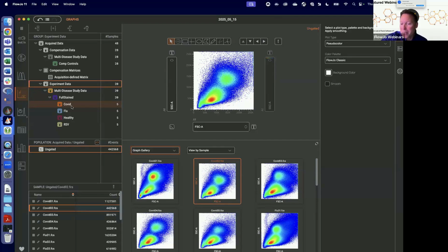Regarding a GMP mindset: I will mention, Lucas Black, that we are RUO only, so the GMP and the CFR 11 and so on are limited. But we do have a full history on the undo list that serves as an audit trail that you can go back to specific spots on. That is probably about as good as I can do for the time being.